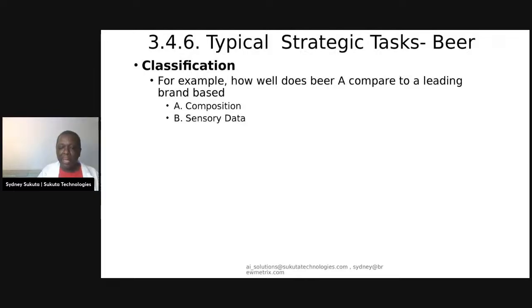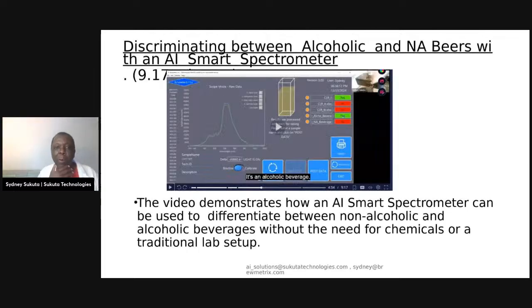All right, so I can explain what we do in this video. We have alcoholic and non-alcoholic beverages, and we run them, and the machine, if you can see here, says color 1. Like I said, I'll do color band 1, and then it will say alcoholic or non-alcoholic. I did about 2 or 3 of those. So that's one way to do it.